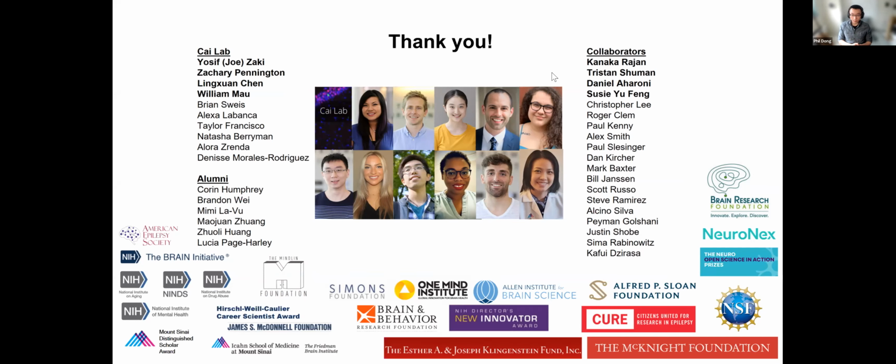Then for a certain experiment where the scope you're using is the same, the brain region you're imaging is the same, we try to use the same parameters, but at least we'll make sure all the parameters are working on each animal's basis. So for each animal, we take 1 session, we visualize everything, we make sure all the parameters work.